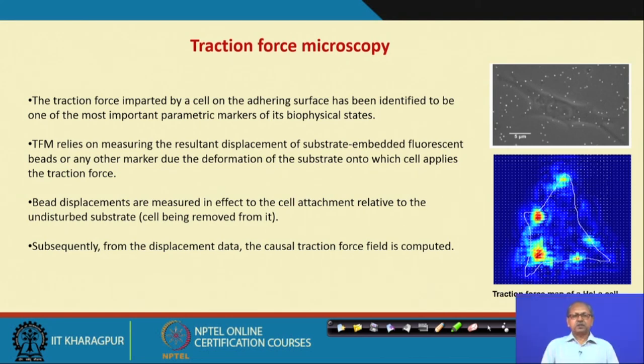Another set of experiments we are performing is on traction force. What is traction force? We have already discussed that: when an adhering cell interacts with the extracellular matrix through focal adhesion kinase, traction force is generated, and that force is responsible for a variety of cellular functions. So how will you assay and quantify the traction force? The general procedure is as follows.